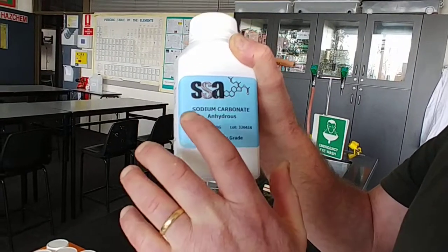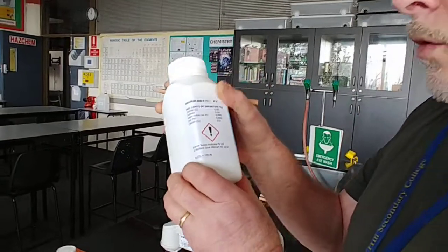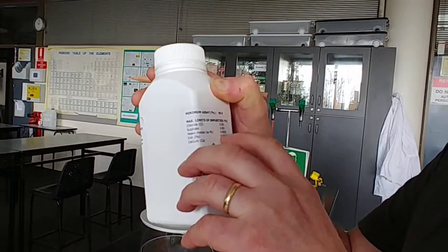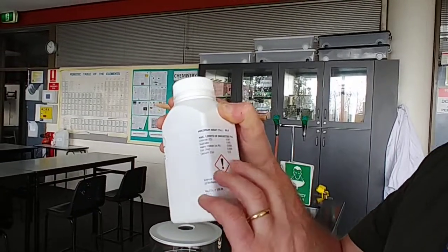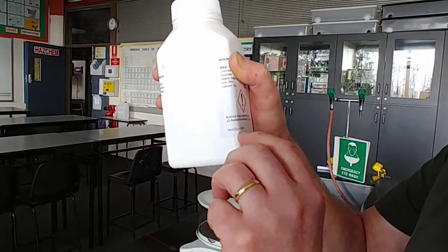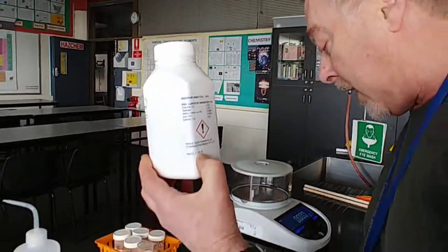Sodium carbonate, not sodium hydrogen carbonate, rephrase that. And this is anhydrous, so it contains no water in it at all. And this is the assay of what's in there, so the percentage of impurities. This is analytical grade, so it's fairly clean. And down here, Na2CO3 has a molecular weight of 105.99. So we'll write that down.